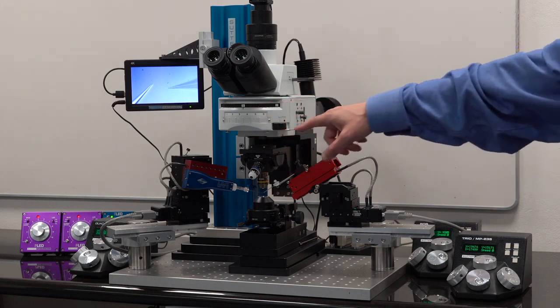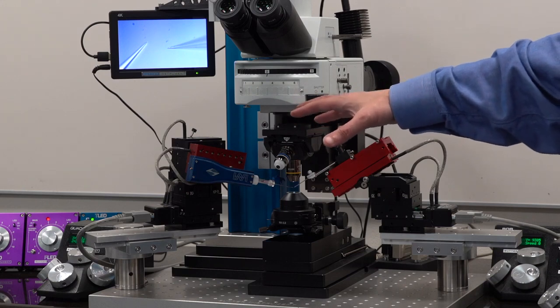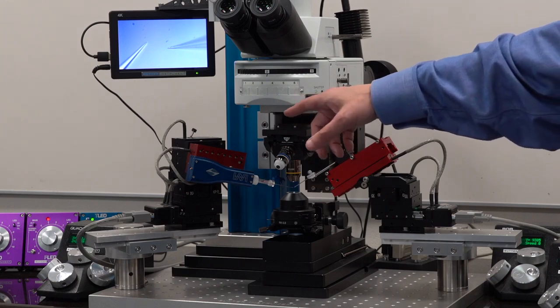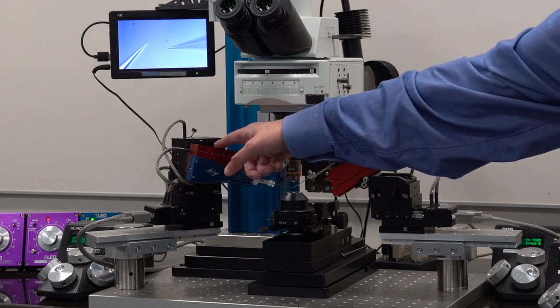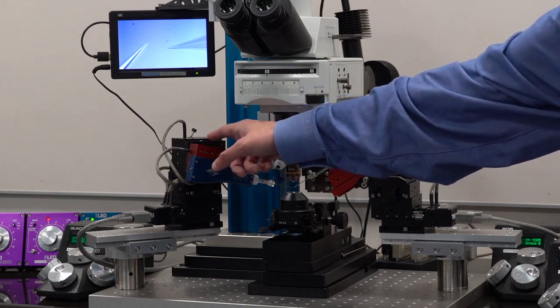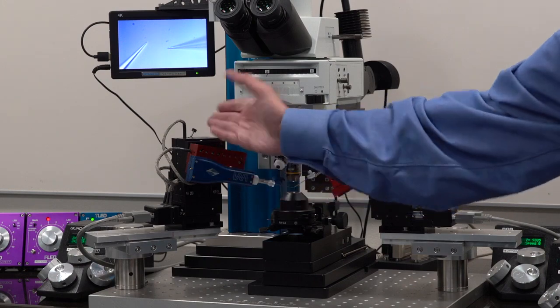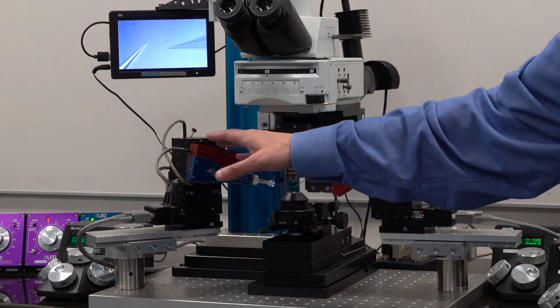The quad is probably the best of both worlds. That means it can easily do in vivo with this true diagonal, the red axis, the true diagonal axis that can be angled any which way. And it has the traditional X, Y, and Z manipulators there.